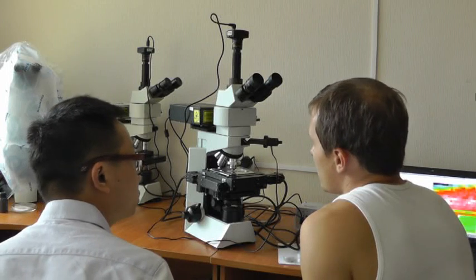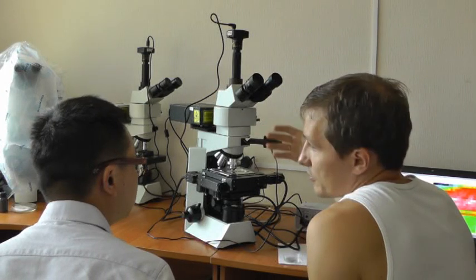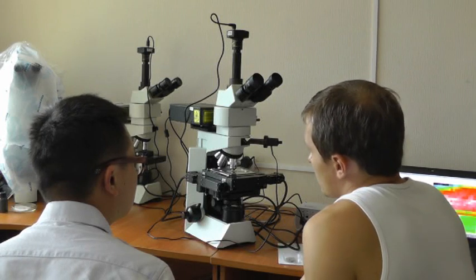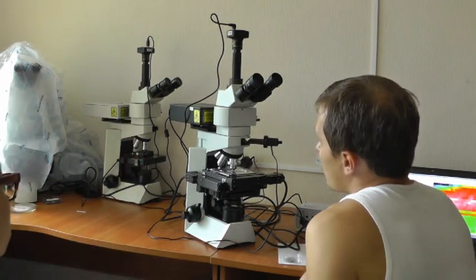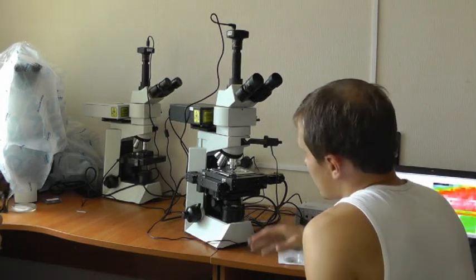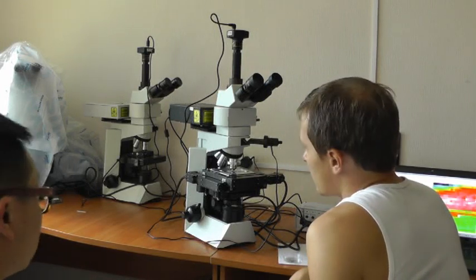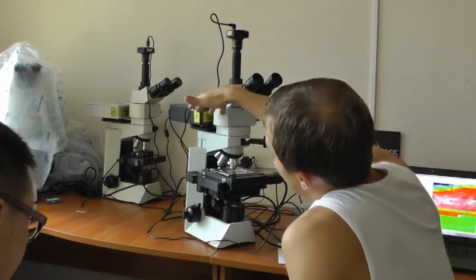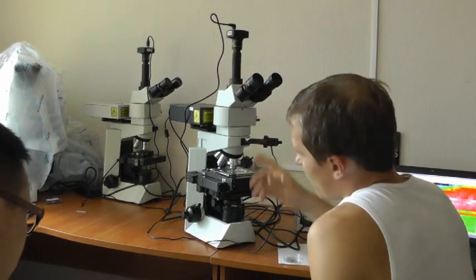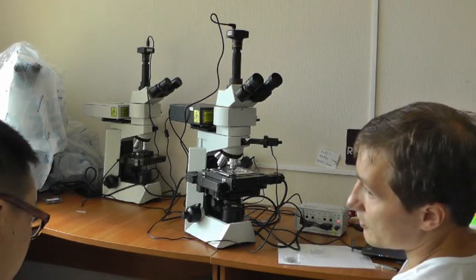It can always be added to the optical branch of any microscope. It's like an adapter which can be removed or added. So it's not a problem, even if the manufacturer doesn't provide standard beam splitters and standard adapters, we can put our Raman module in a trinocular hole and it will work as well.